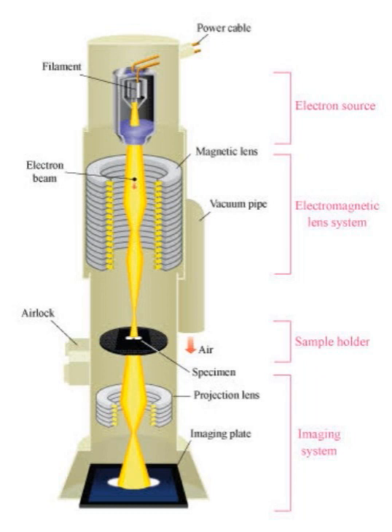What are the parts of the transmission electron microscope? First, the optical system and the components. The electron microscope consists of a column or stack, at the top of which is mounted the source of illumination, the electron gun, which emits electrons from a hot tungsten wire filament.